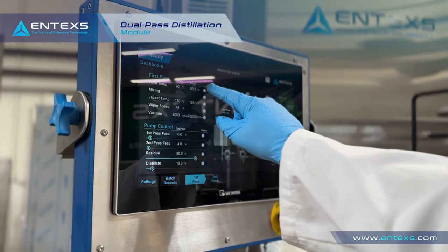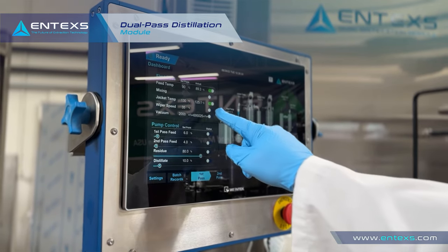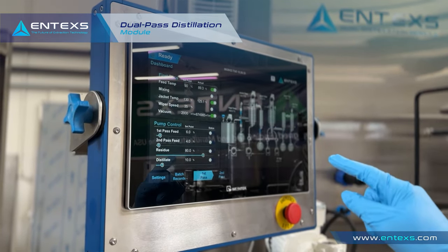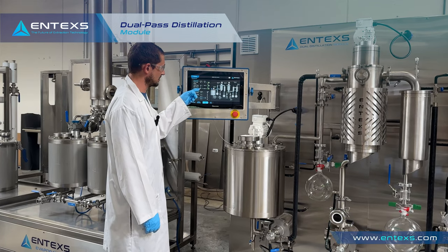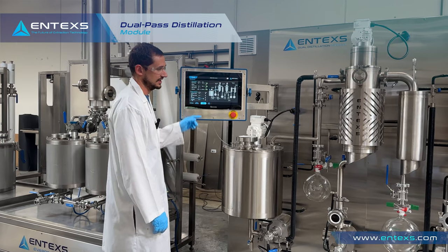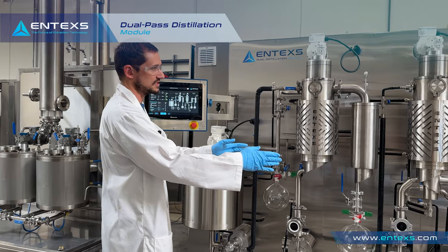To start up the system we turn on our heaters first and let them get up to the desired set points. The next step is starting up our vacuum system. That controls vacuum down to 2000 millitorr, and we have two separate vacuum systems — one for the first pass and one for the second pass.